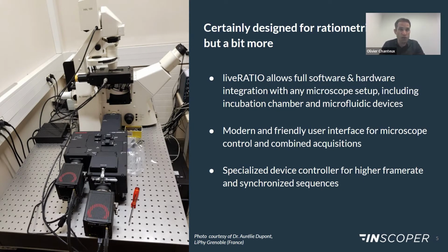The liveRATIO is a complete software and hardware package not limited to ratiometric imaging applications. In fact, this is a standalone image acquisition solution that controls the entire microscopy system. Users benefit from a modern software environment to easily set up their multidimensional acquisition sequences.